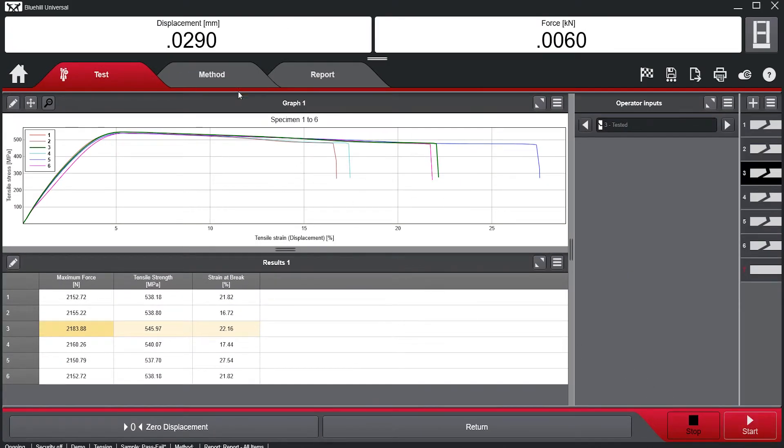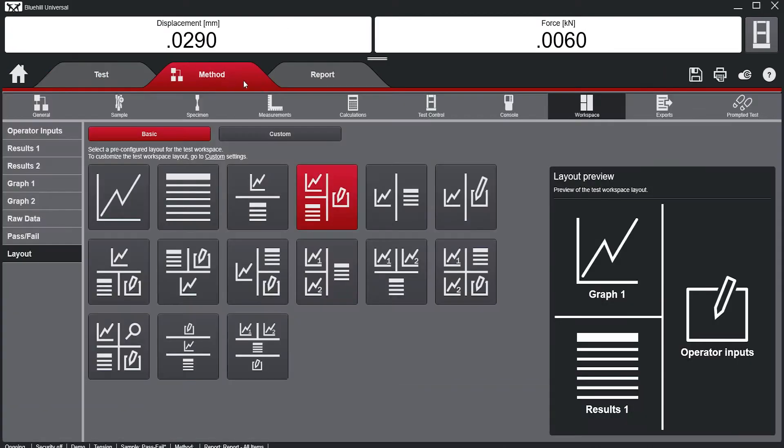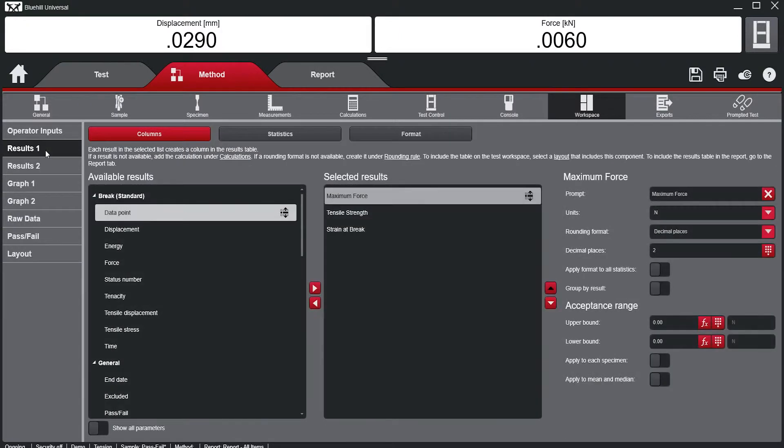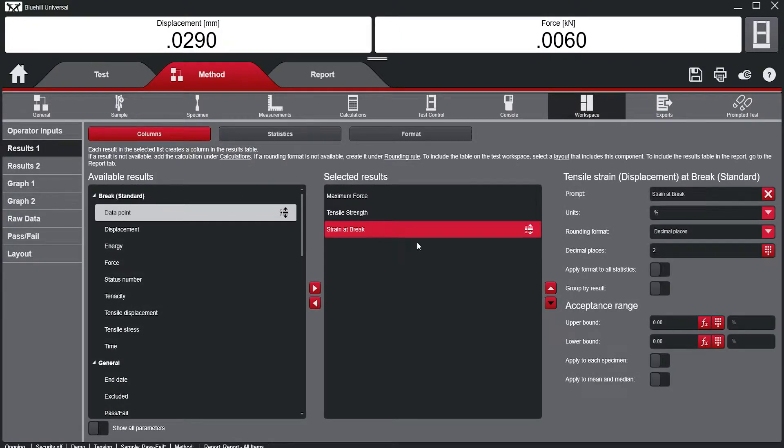Within the Method tab, under the Workspace section and Results subsection, the acceptance range can be set for each individual result.